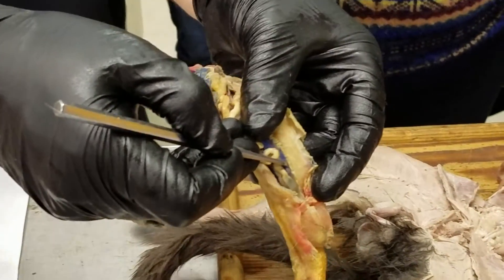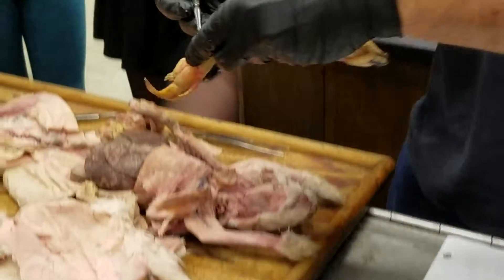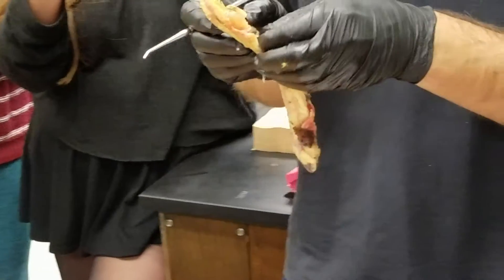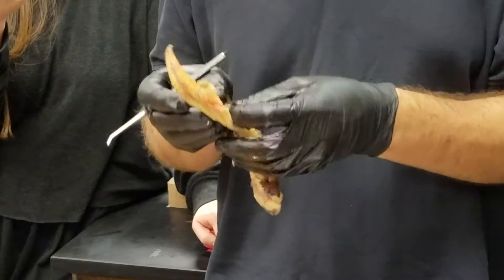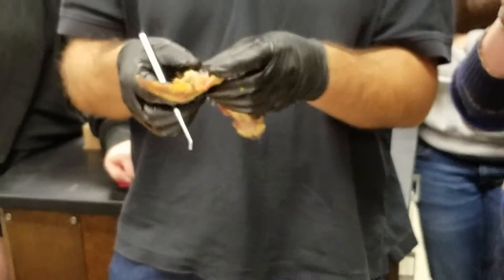That tissue is the opistonephric kidney — all in there. If you pull the arcanephric duct away from the kidney, you can sometimes see the little collecting tubules running over to it, draining the urine from the kidney into the arcanephric duct.